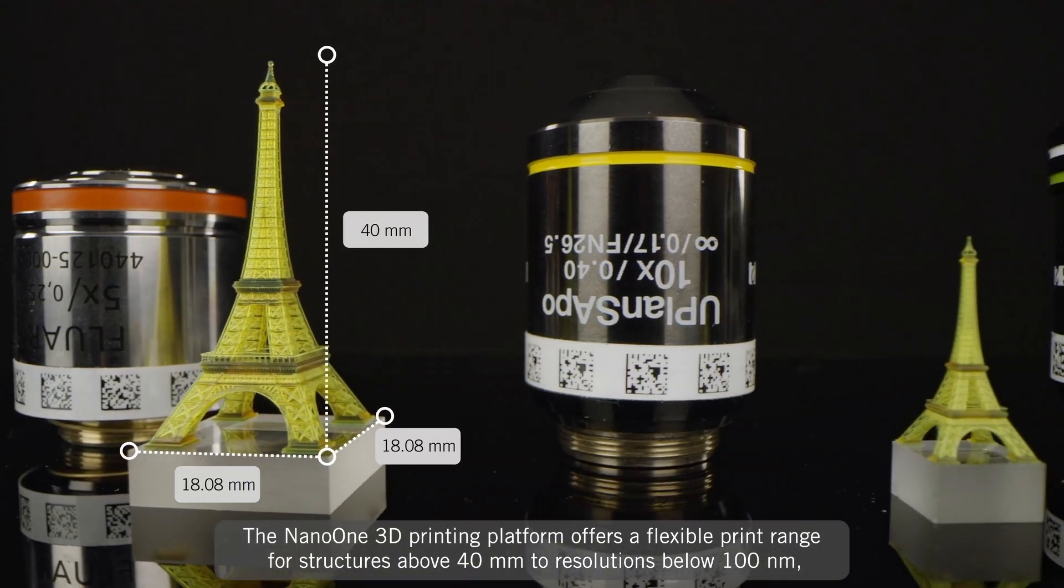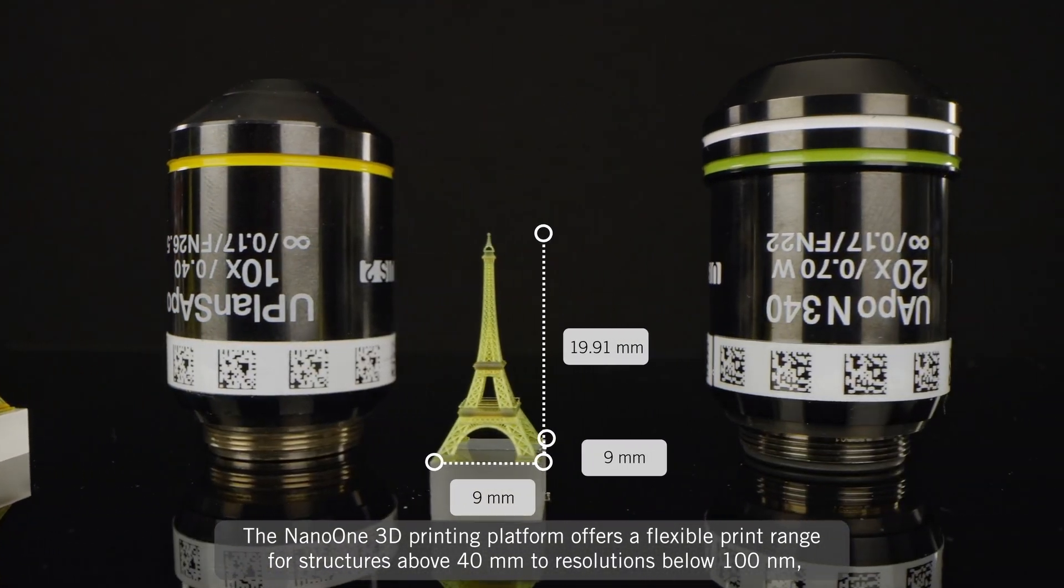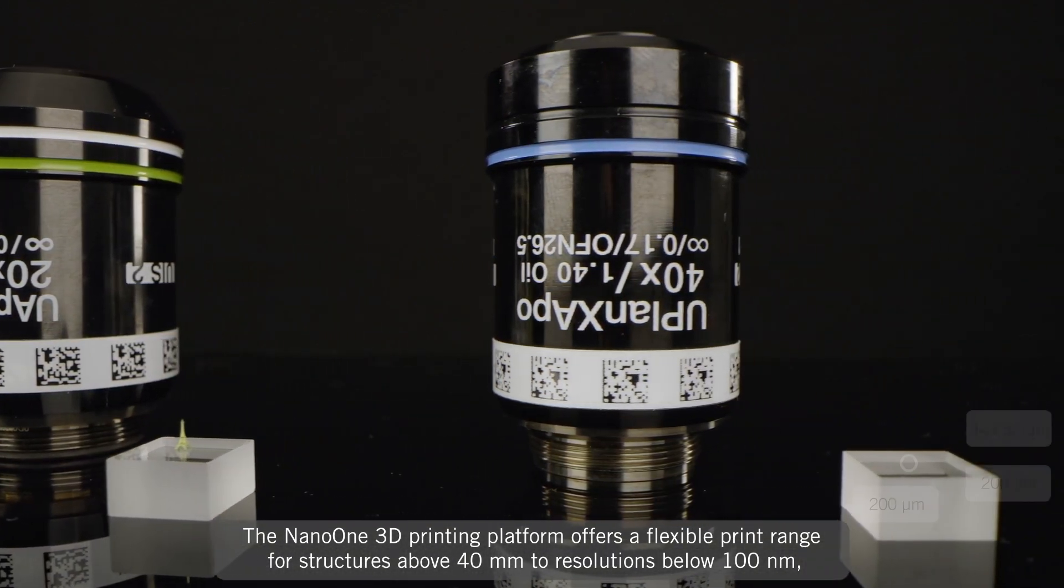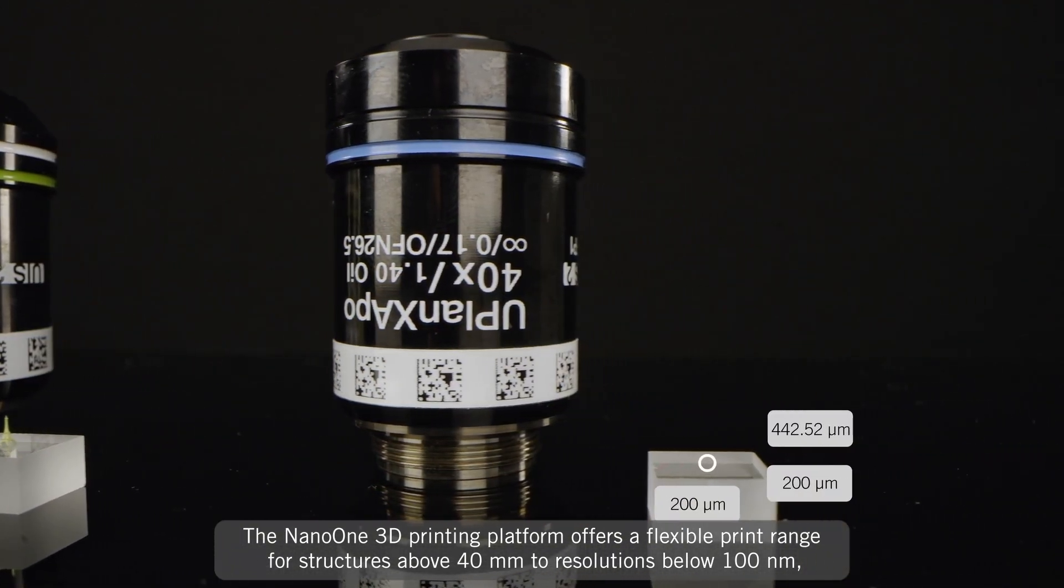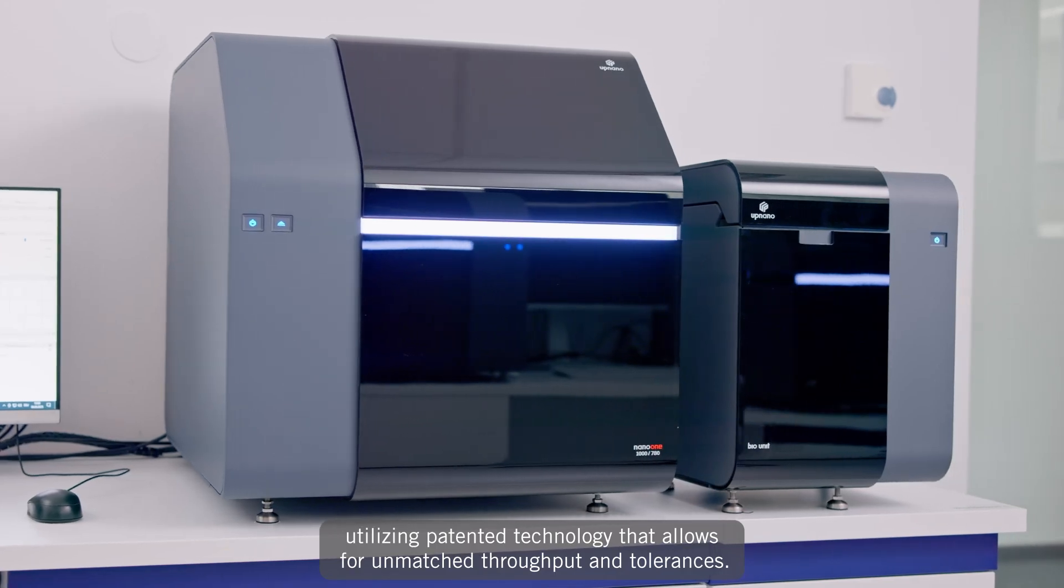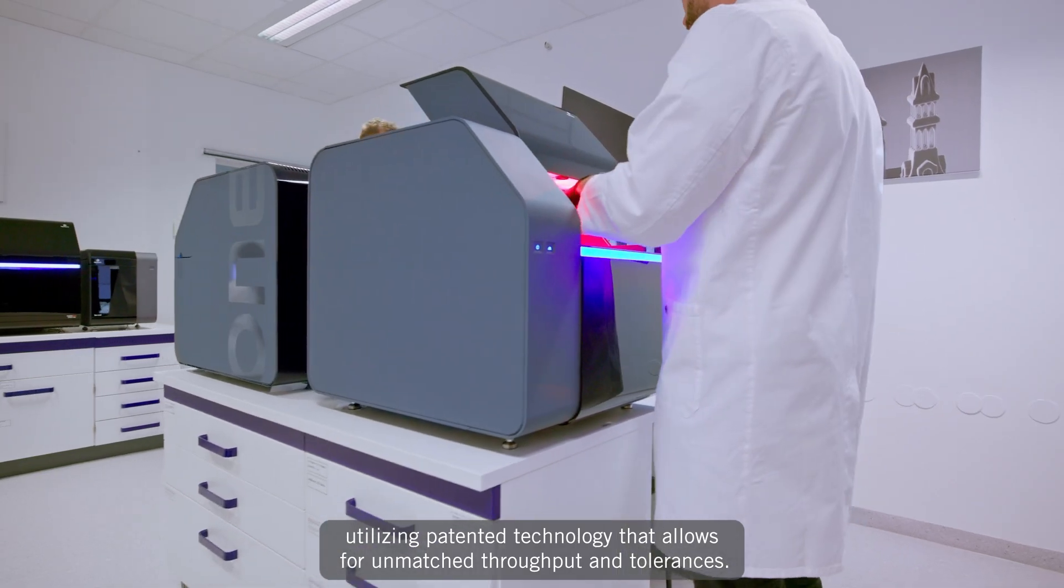The Nano One 3D printing platform offers a flexible print range for structures above 40 millimeters to resolutions below 100 nanometers, utilizing patented technology that allows for unmatched throughput and tolerances.